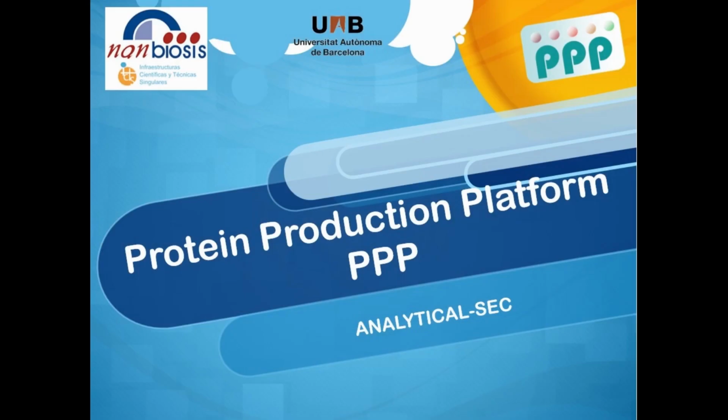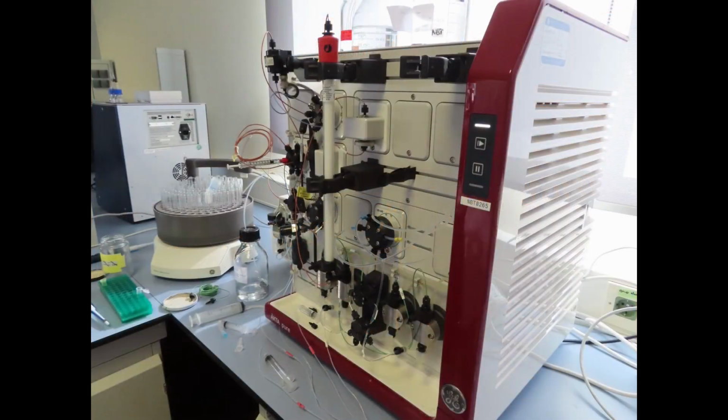Analytical size exclusion chromatography. The analytical SEC is not a purifying method, but rather is used to look at the protein size profile, homogeneity, and aggregation. This step can be necessary, for example, when proteins have been stored for a long time or even frozen.